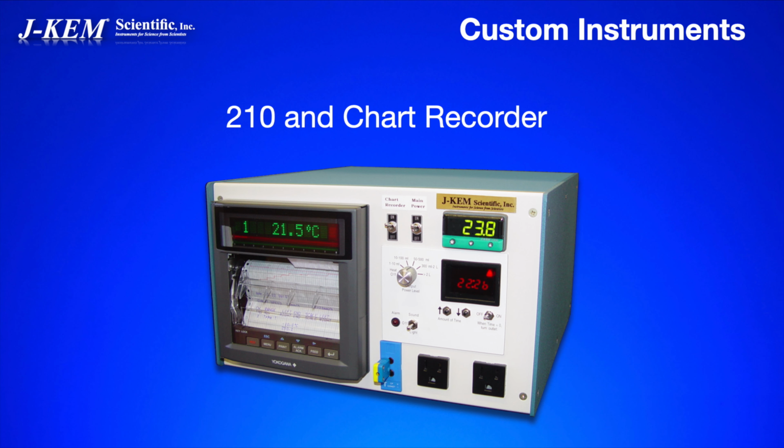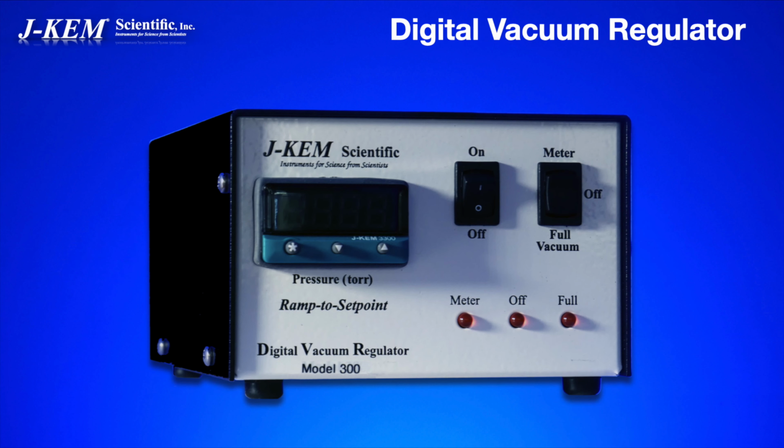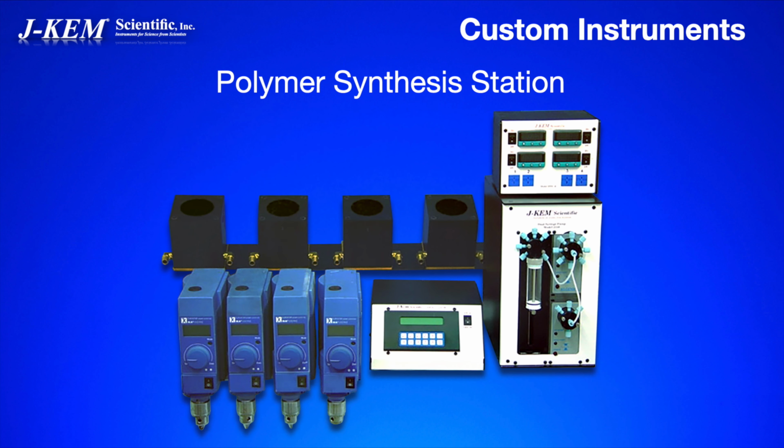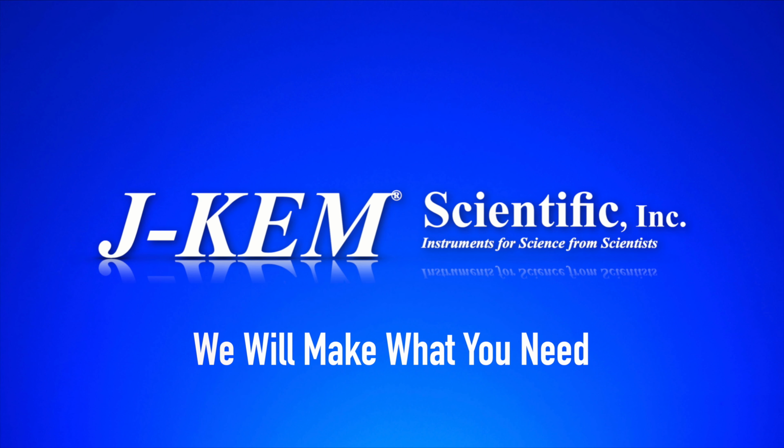The company J-KEM started making temperature controllers. But just as our motto is we're scientists making instruments for science, people called us and asked us for other products. And as time went along, we make precision vacuum controllers. We make precision pump systems. We make custom robotics. Everything in J-KEM was research-driven.